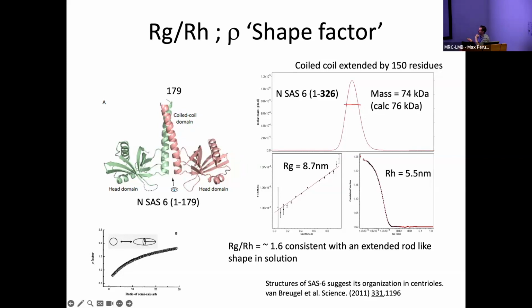And this is all information that every time you do a run with the protein, you get all this. So quite often you don't use it. You might just want the mass, but it's just important to know that that information is in the data. And we can help you get that out.